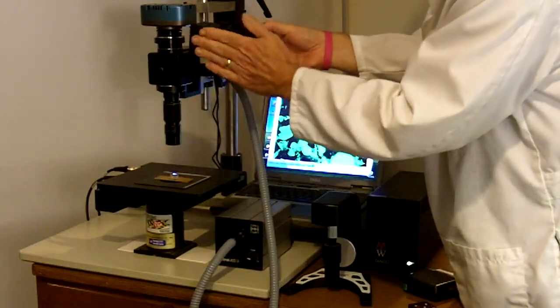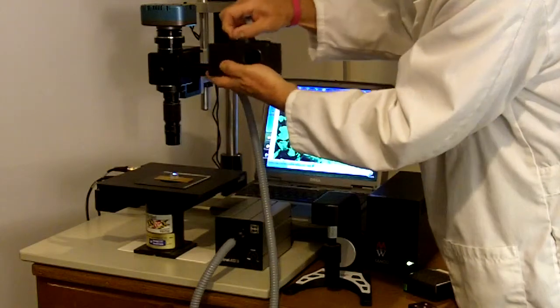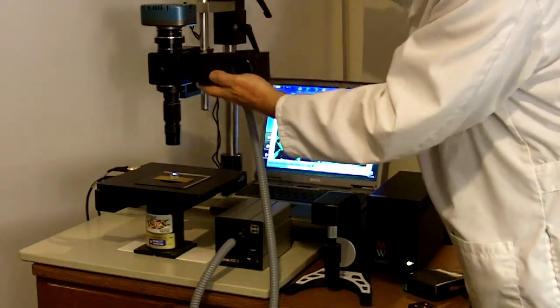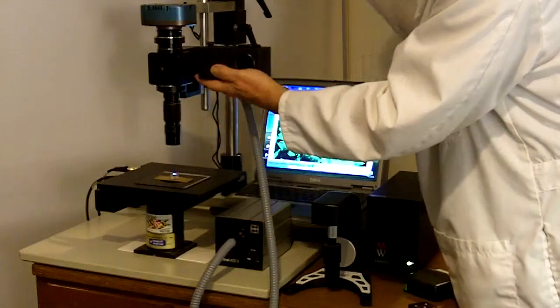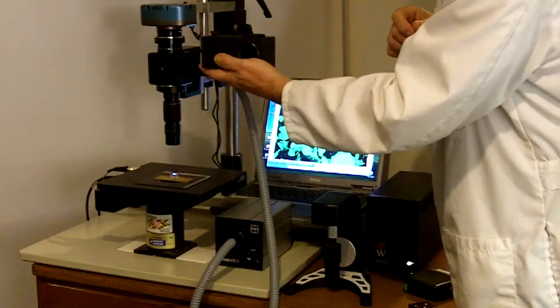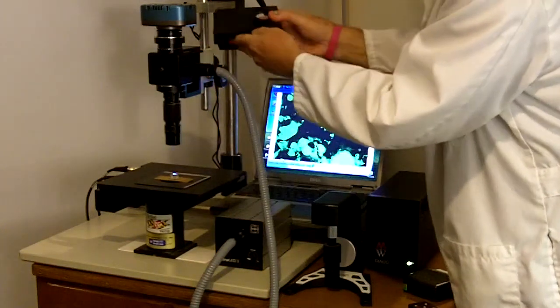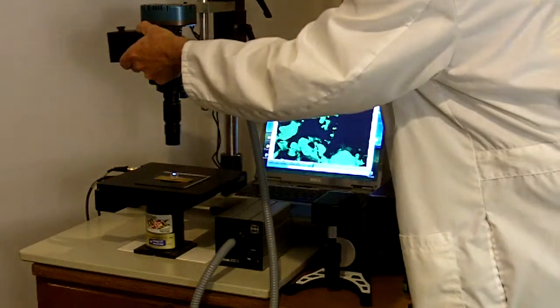Say a Peltier cooled camera from the front port and then a second port for a digital SLR camera or a black and white high performance camera. So again, this dual port beam splitter attaches right here.